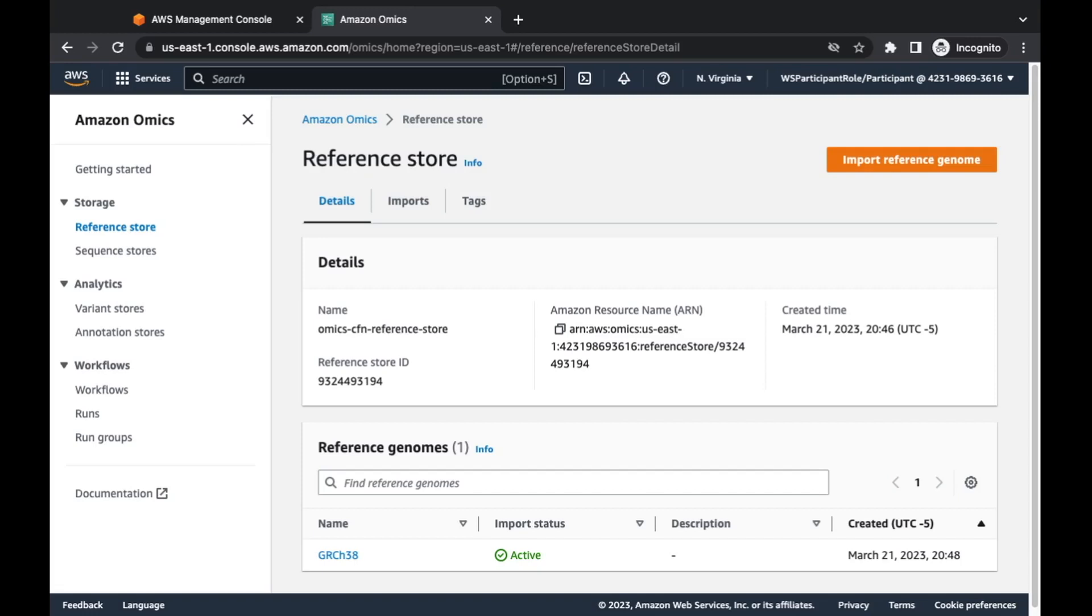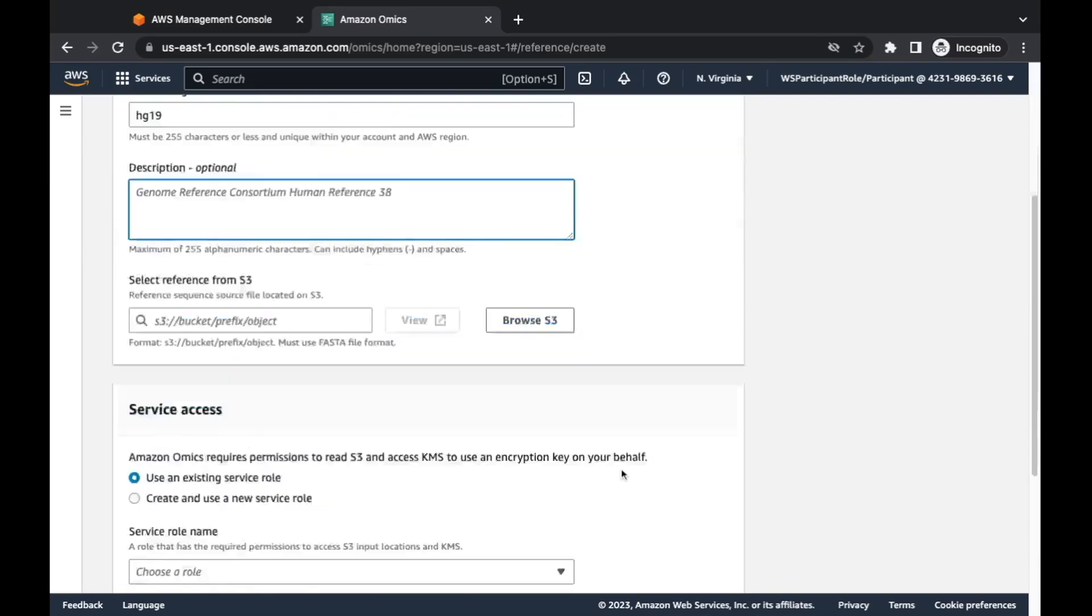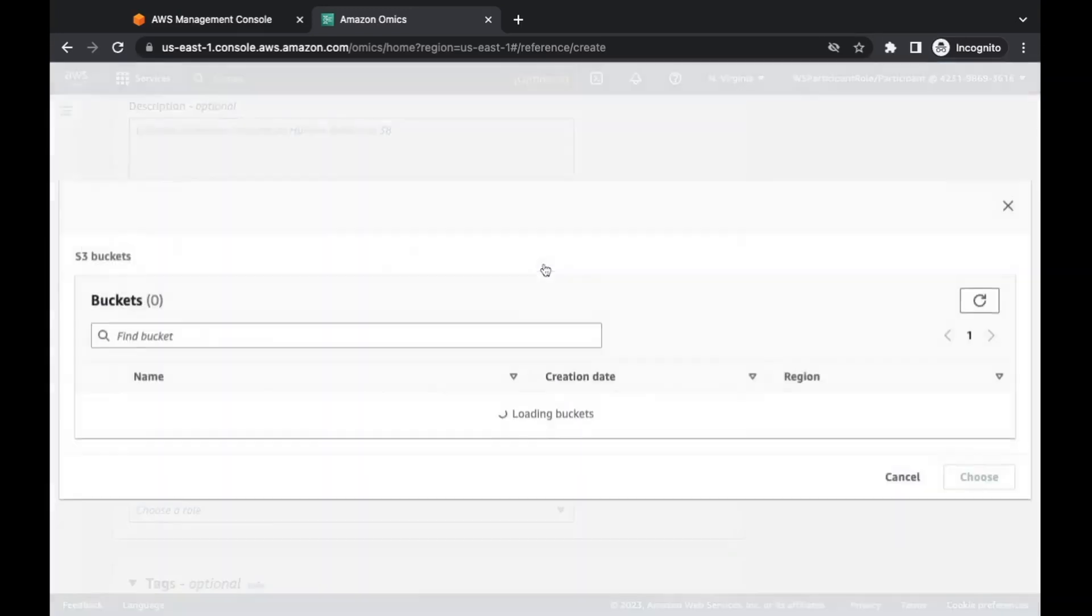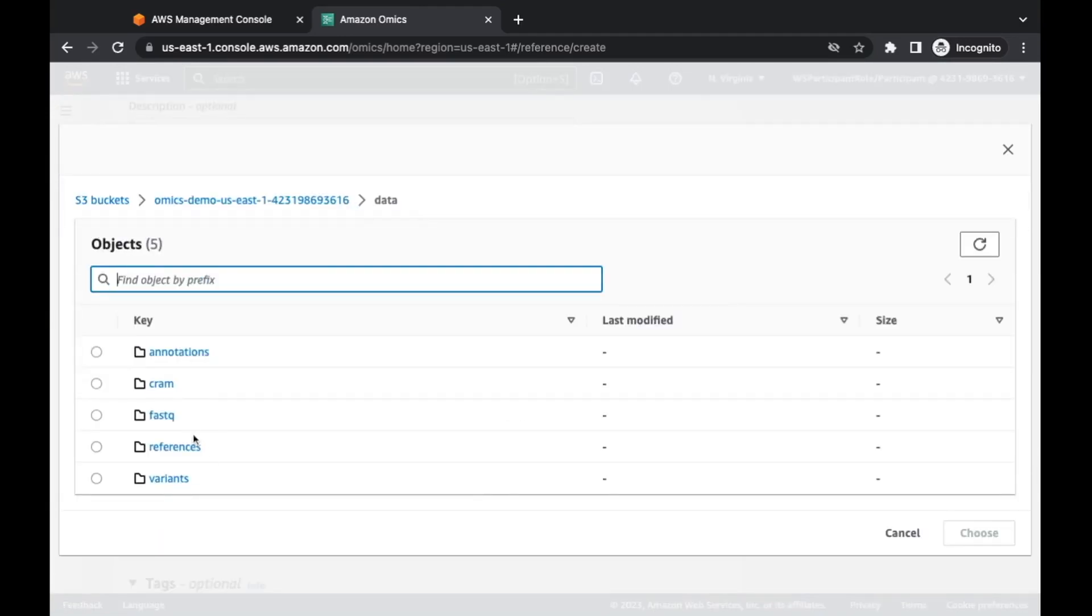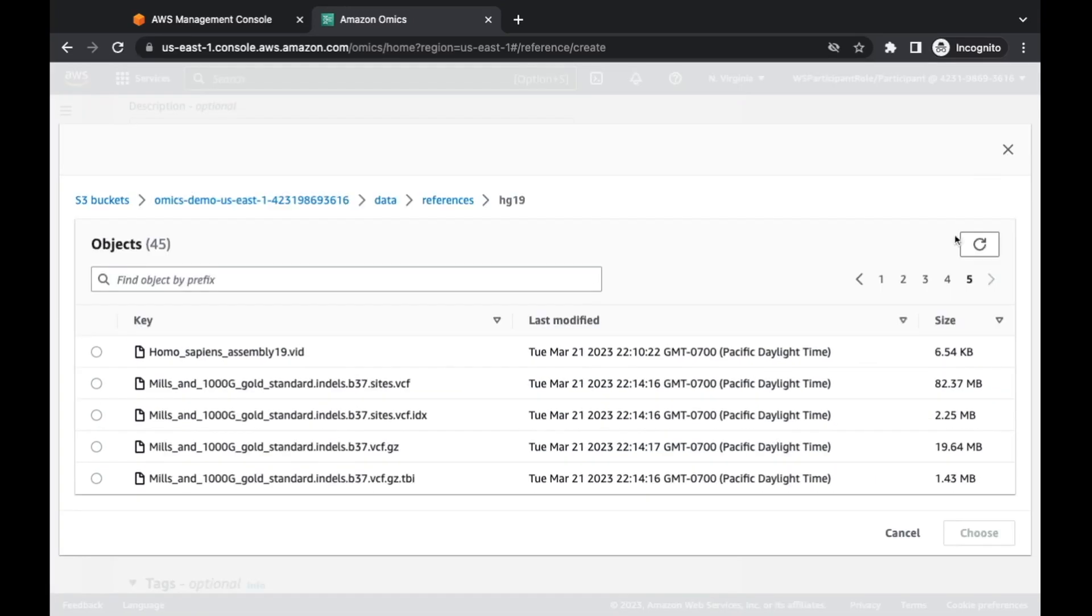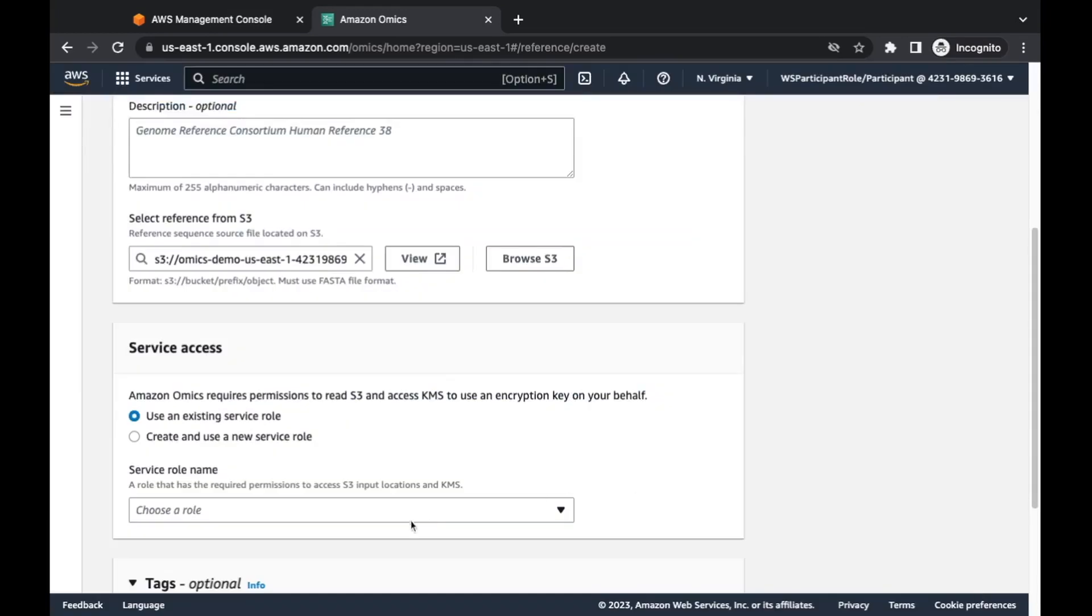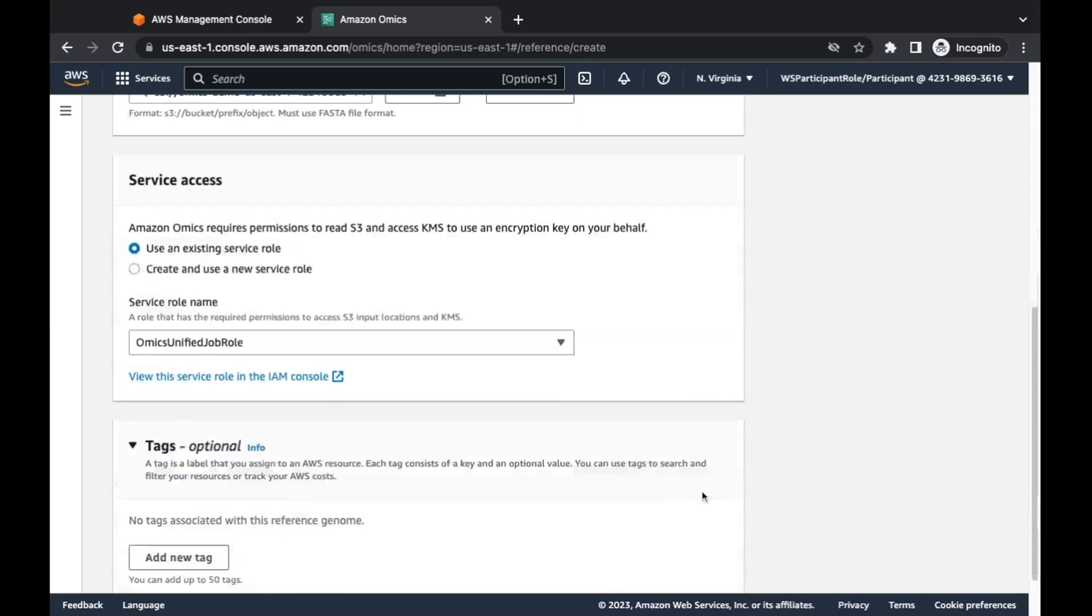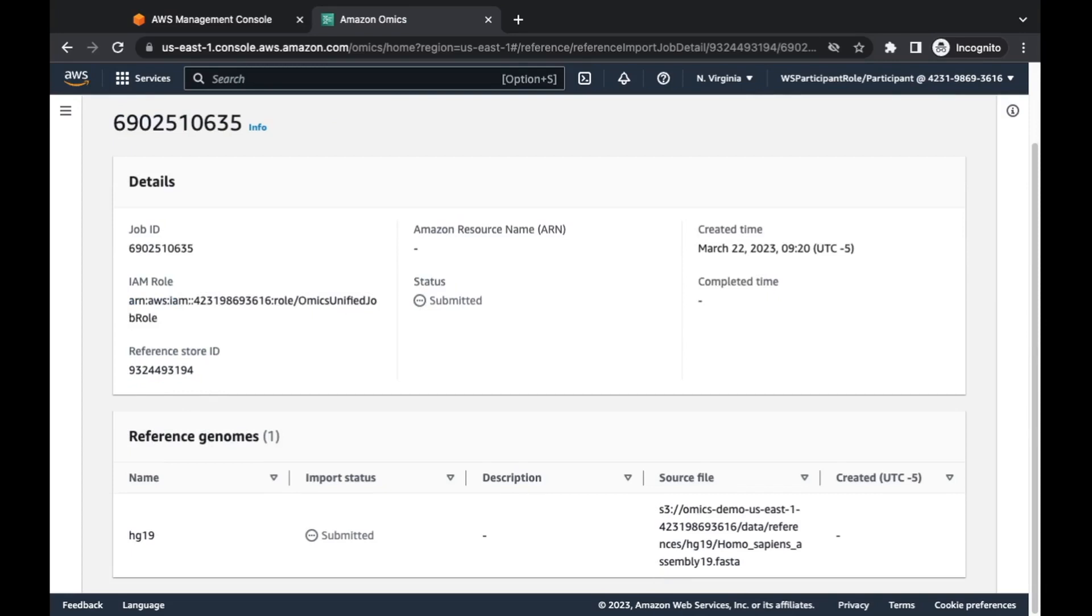Then take those variant calls, put them into an analytical database of sorts, and then query on those variants so you can get some deeper insights into why those variants are important and what you can do about them. Alright, so here I am on the Amazon Omics console. We're going to go over here to storage. Under there we're going to see we have reference store. I've already got one imported in here, I've got HG38, otherwise known as GRCH38.